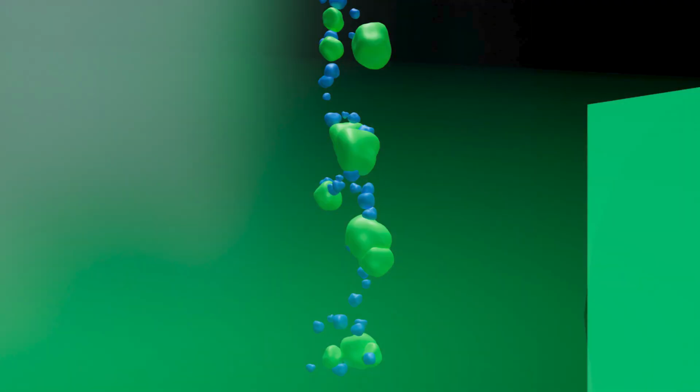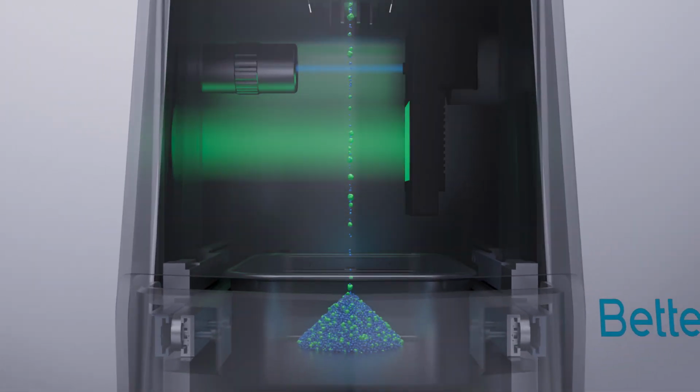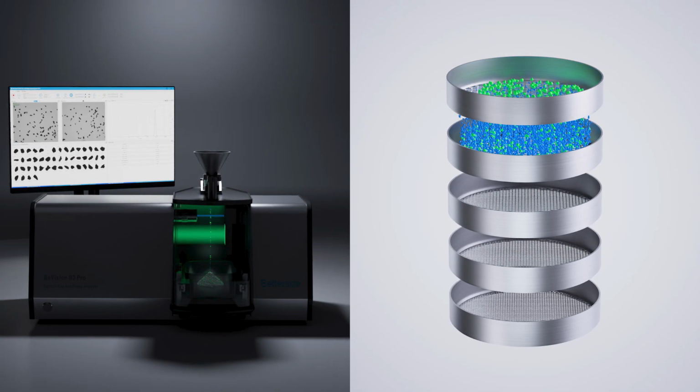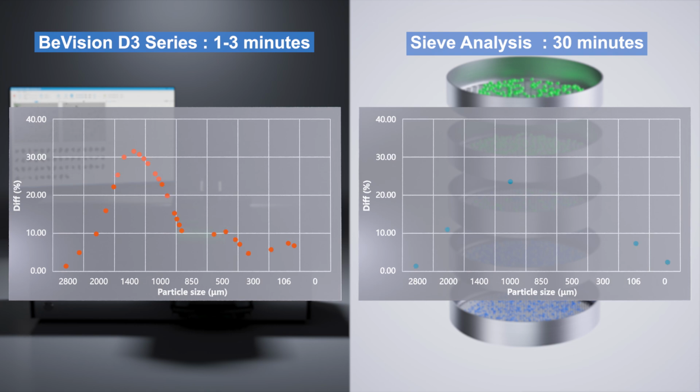After measurement, all particles are fully recovered in the collection tray. The BeVision D3 Series measures what traditional methods can't define. With full automation, results are delivered within 1 to 3 minutes.